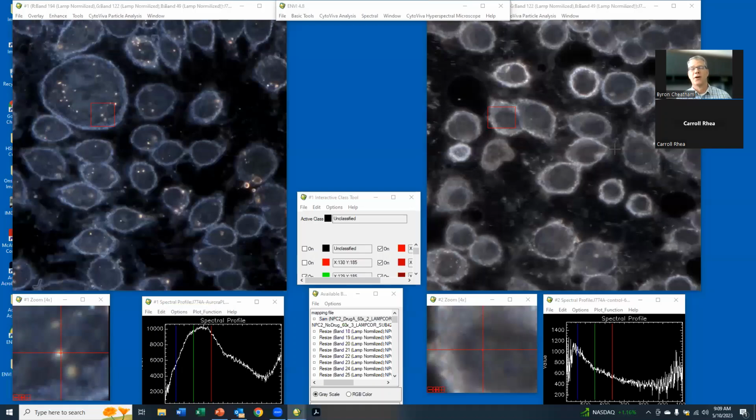And so just from an optical perspective, you can see that these nanoscale LDL materials have been internalized by these macrophages. You can see them there, and the differences are clear and obvious just from a qualitative optical perspective. But because this is a dark-field hyperspectral image, what that means is that every pixel, and this is a zoom image of this red square that we have here, of this larger cell that we have, you can see that the crosshair here is on a pixel that has one of the LDLs. You can see that that's here in the big image that we have.